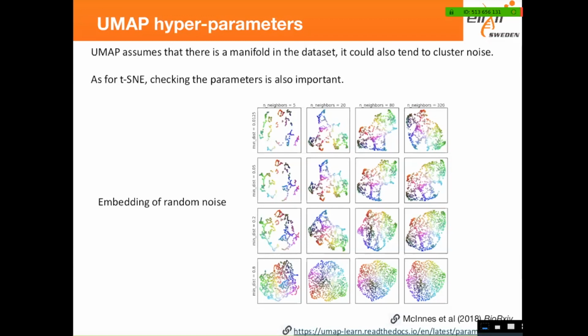And how do you evaluate that? Using biology. So you need to know or have, for example, differentially expressed genes between that cluster and the other one. Otherwise, if you generate two clusters and there is not a single differentially expressed gene, then that is a good indication that these are clusters that were generated artificially because of your method. So they should actually be together. Or maybe a data integration issue.